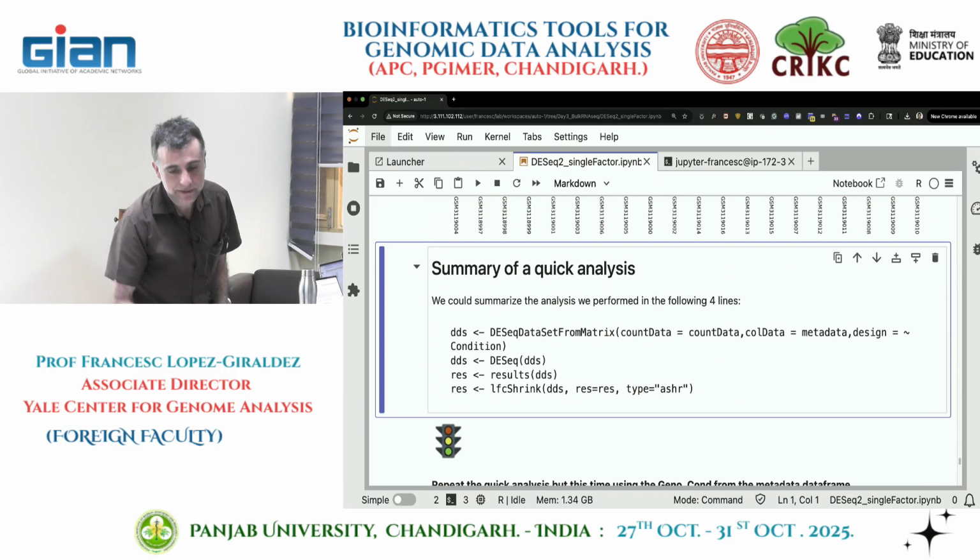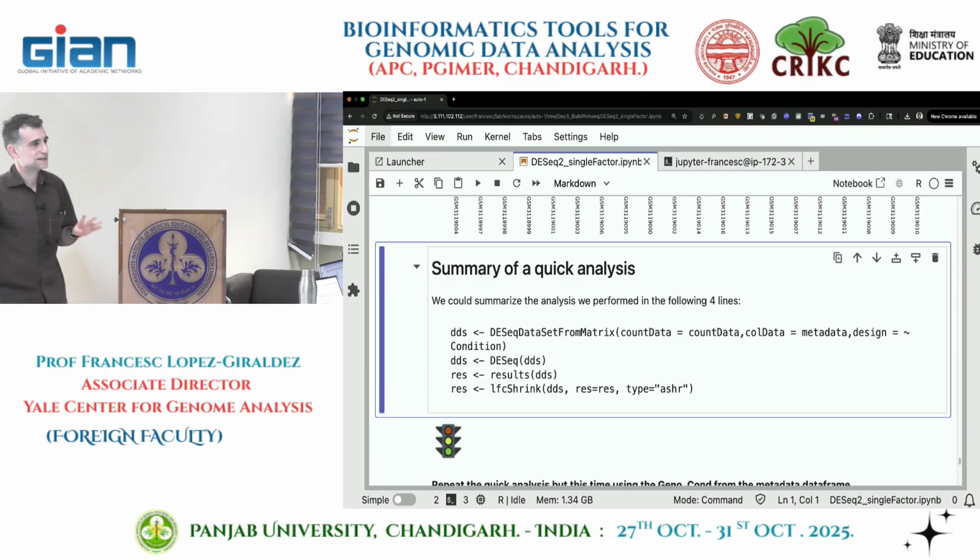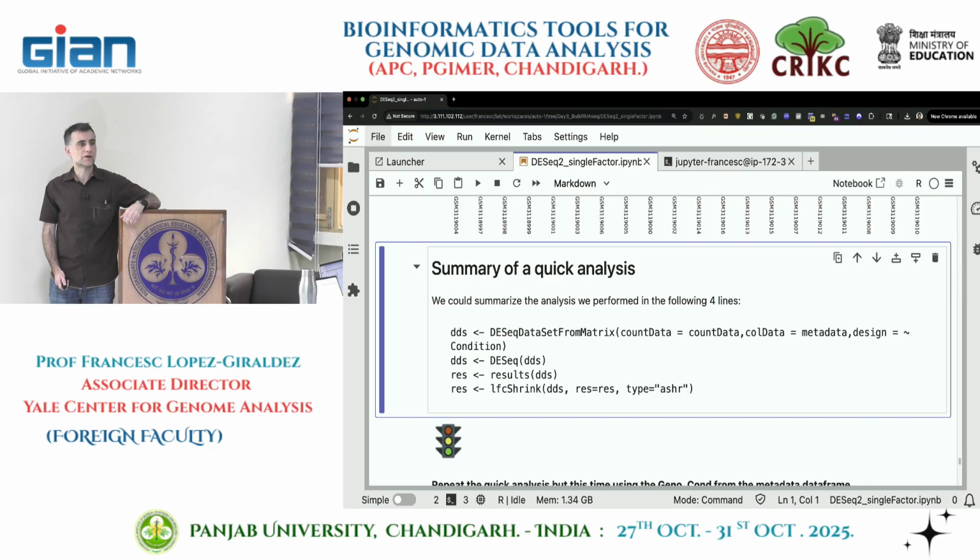Okay, summary, right? To do an analysis in DESeq2, or sorry, anyone have questions? Pheatmap questions? No? Should I move on? We are getting an error.